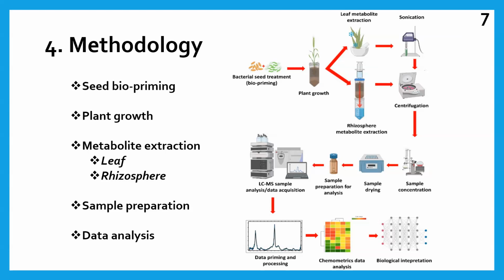Okay. Are there any questions anyone would like to ask? There is a hand up. Bello, would you like to ask a question? Hi, everyone. Thank you, Dannies, for the beautiful presentation. I don't know if you mentioned this already, but I wanted to ask why seed biopriming instead of inoculating the plants with the bacteria that's already in Luria broth or any other broth, for instance? And a follow-up question: is there a significant difference between the two priming protocols?